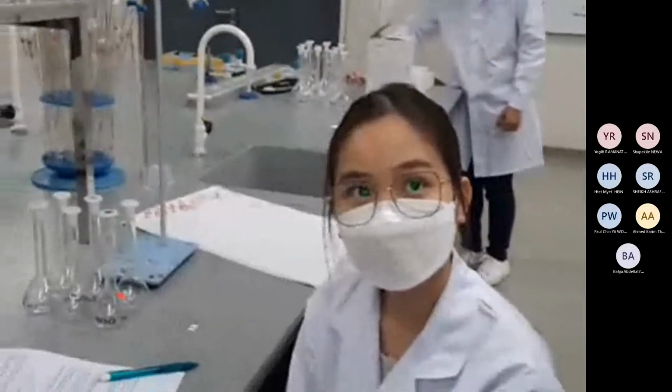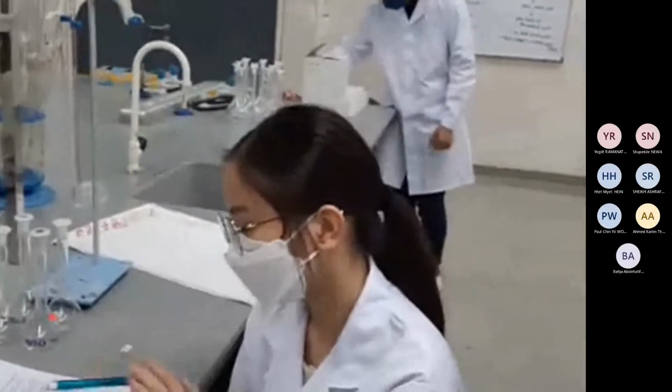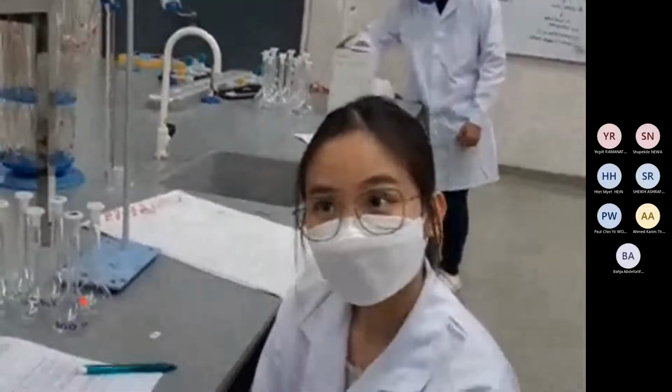Another thing is, every time you take the solution, rinse it. Rinse means rinse it, don't wash.